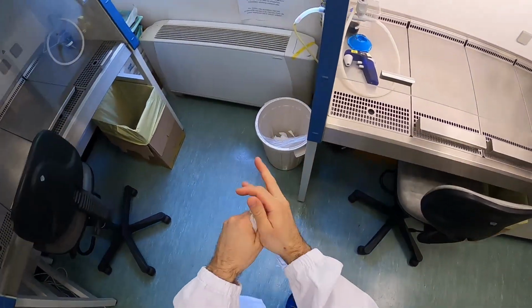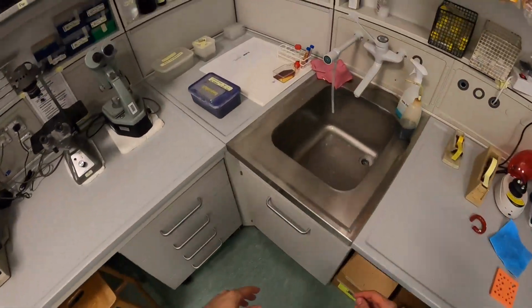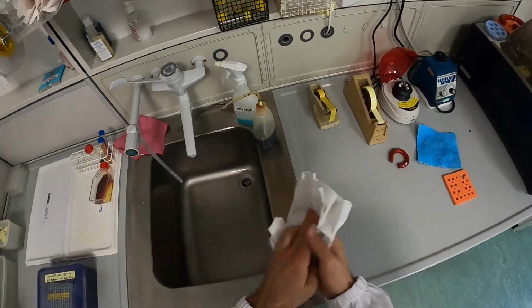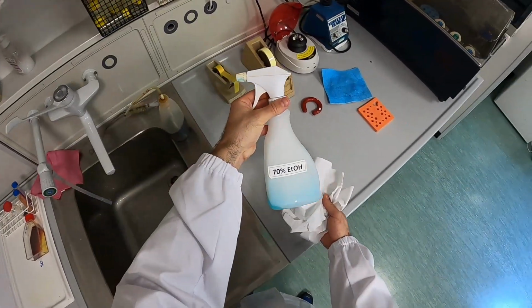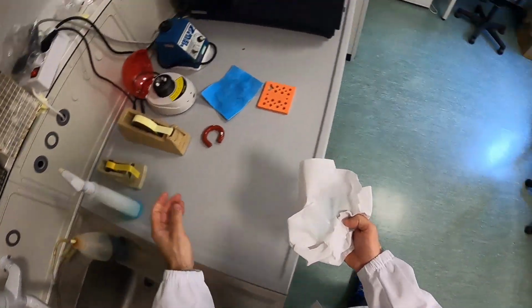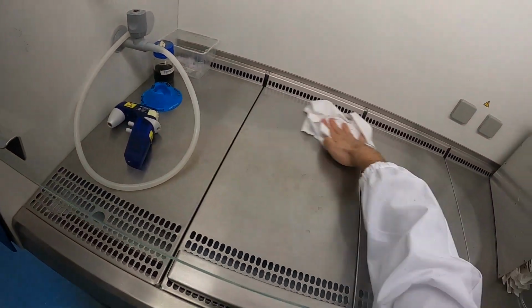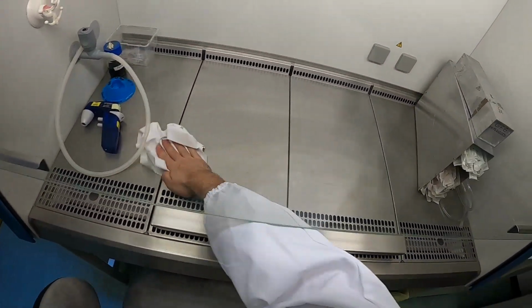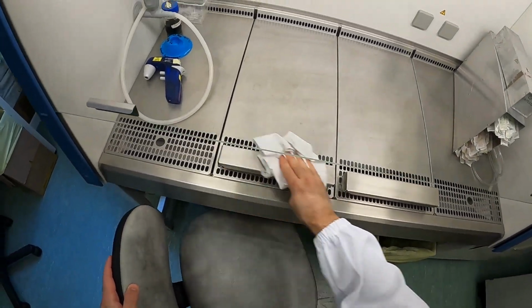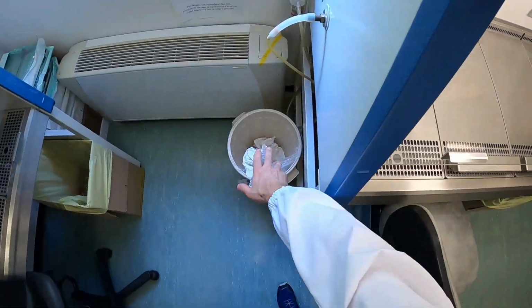Okay, and with clean hands we can now also clean the laminar flow cabinet. So we take another piece of paper and spray some 70% ethanol on that. And then we wipe the working area from the back to the front. I mean, this hood for sure is left clean by the previous user, but I think it's a very good way to start your experiment by cleaning your working environment.